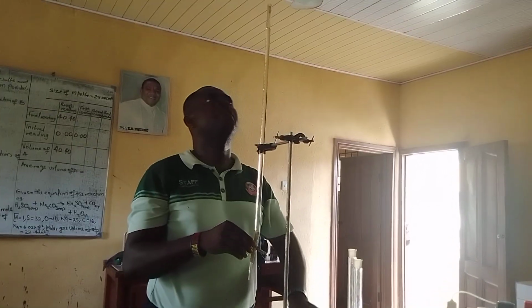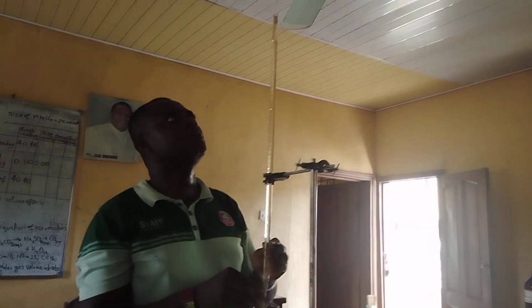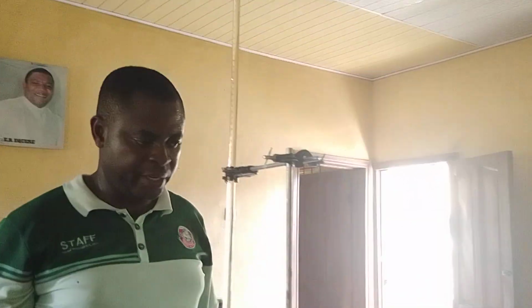So I remove my funnel. Okay. This is at meniscus already. So I want to throw away the initial thing. You can read from there.